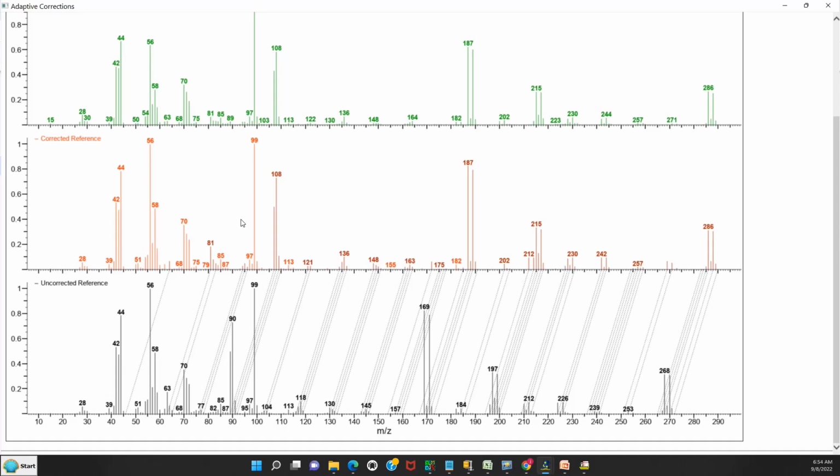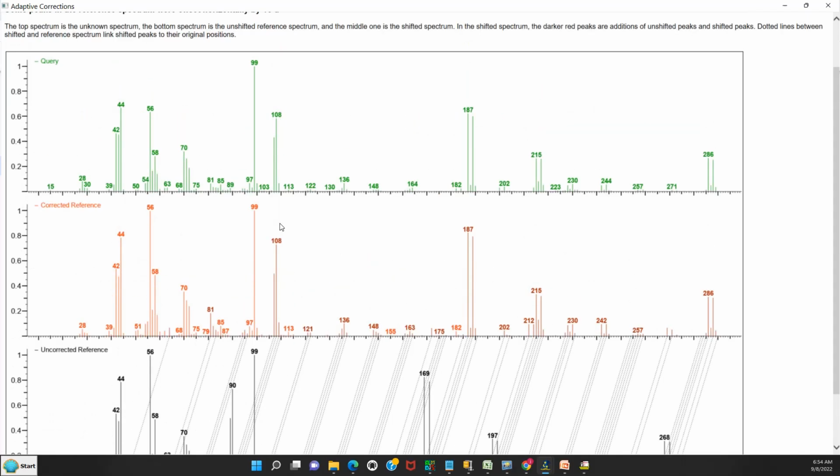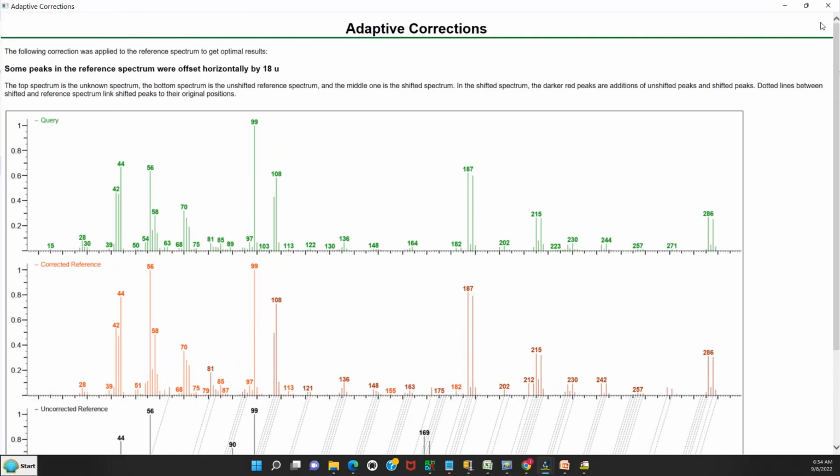So it's really a blended spectrum that's a mixture of the regular fragment spectrum that one would note, plus the masses that the algorithm has decided to shift. You can see it does an amazing job of doing this, but really this is how it works. It corrects all of the reference spectra that it searches versus this to calculate this blended hit quality index, which, in my opinion, is quite an amazing process.